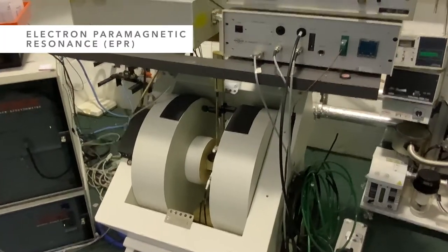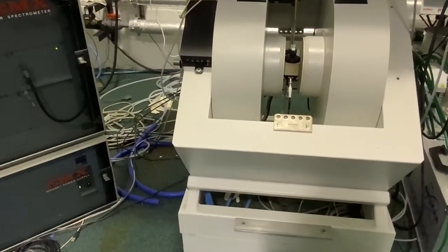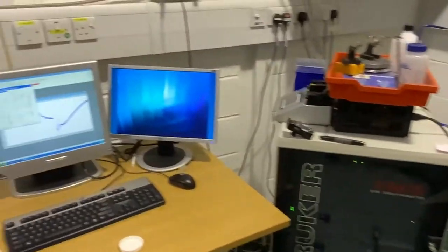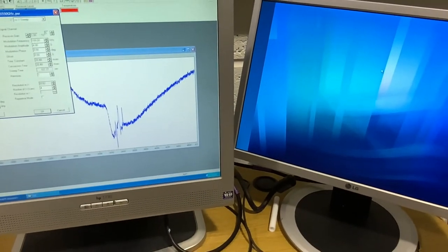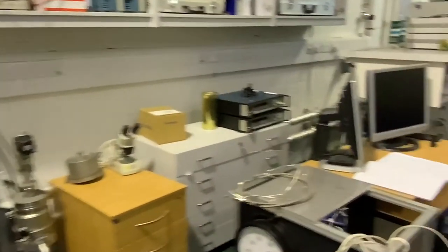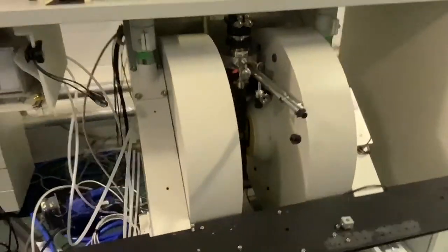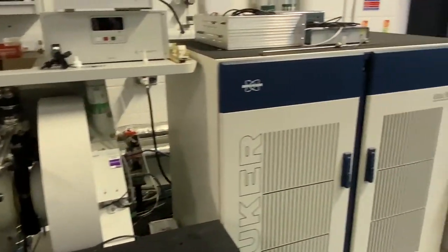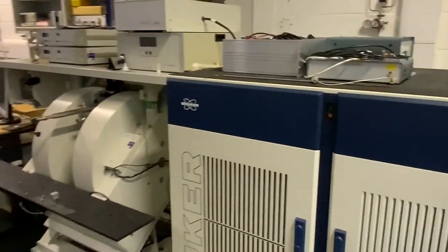The last technique I would like to introduce is electron paramagnetic resonance, EPR. EPR uses microwaves to probe unpaired electrons and it can provide information about the chemical composition and quantities of paramagnetic species in a sample. We have two continuous wave X-band machines like this one, which are capable of measuring samples with variable temperatures and can be used to measure reactions in real time. We also have an X- and Q-band pulse spectrometer, which is capable of measuring spin relaxation times as well as transient paramagnetic species.